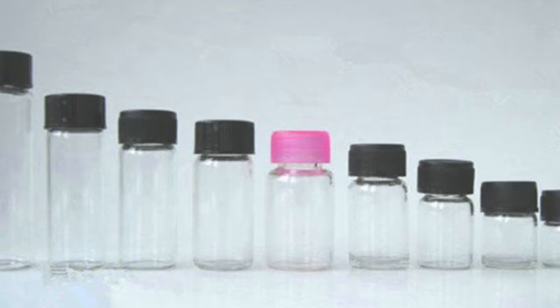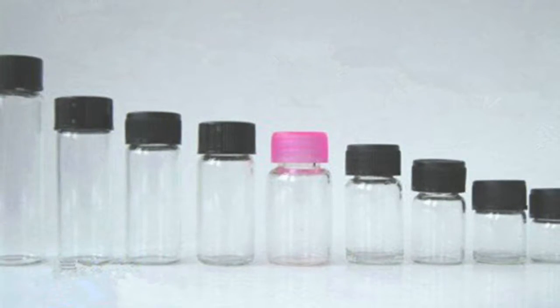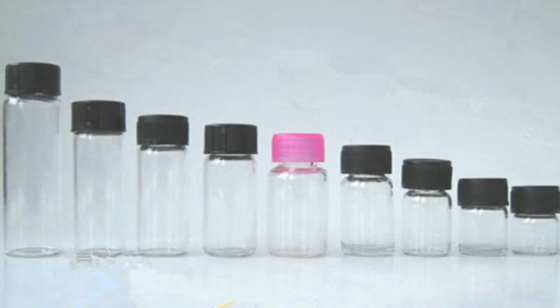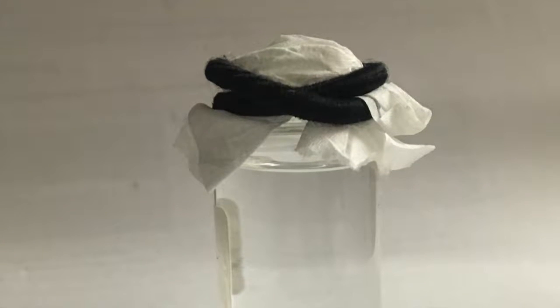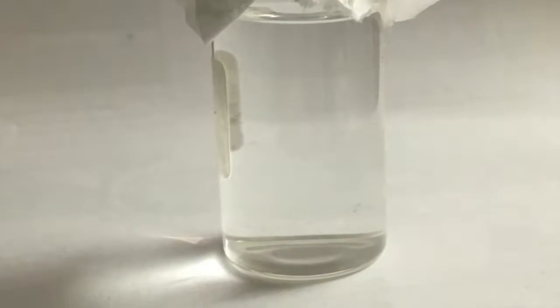It is important that the solution be saturated because a high concentration of alum particles increases the likelihood that the alum molecules will collide and ultimately crystallize. Finally, to allow the crystals to form, the saturated solution was filtered into a small vial to ensure that no undissolved salt was added, and was topped with the Chem wipe to ensure that ideal conditions for crystallization were maintained.